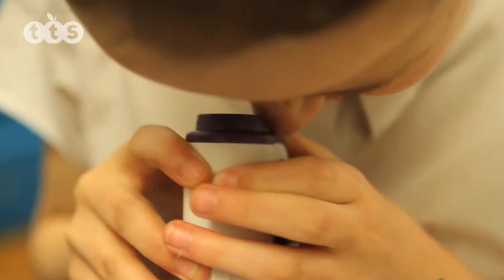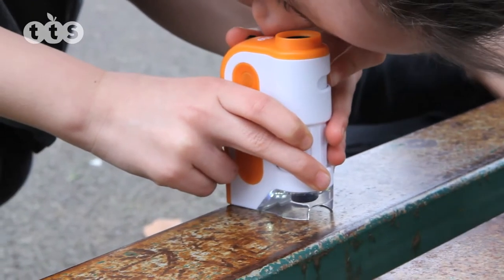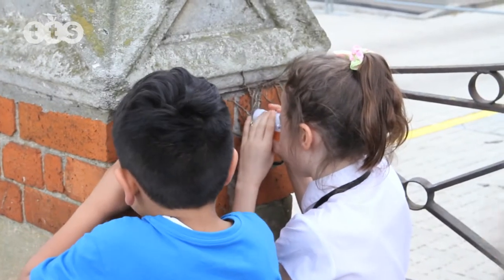Children will be able to identify different fingerprints, look at natural specimens, rocks, plants, man-made fibres, and explore the world inside and out.